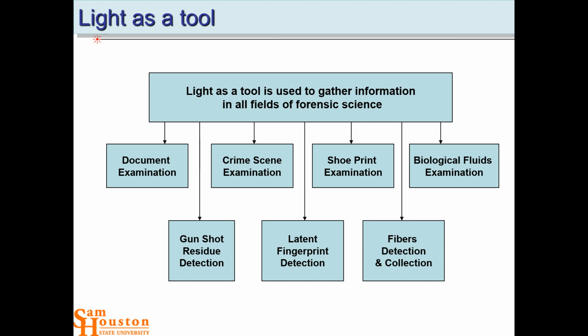And it's very, very sensitive, because anytime you detect light, like we saw, we couldn't see it with the room lights on. We turned the room lights off. Now we've got a very dim background, and the fluorescent bits of skin and sweat were emitting light. They were absorbing the UV and emitting visibly. So we had a dark background, and that's a really important point. Fluorescence and chemiluminescence are the most sensitive techniques you can have, because you can turn down the background, and then the evidence emits light. So that's the best situation ever. Luminol will react with the iron in blood and give off light. That would not necessarily be an alternate light source, because you're not hitting it with a source of light, but an alternate chemical that emits light.